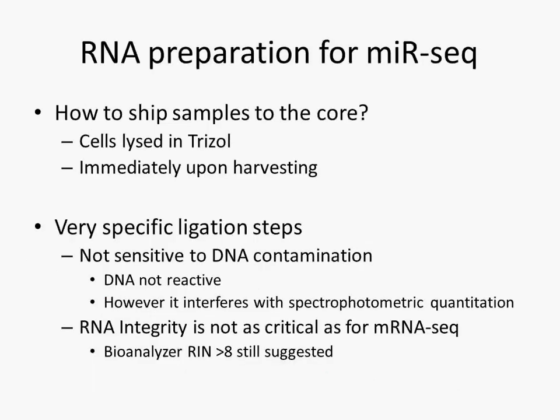So how do you prepare RNA for mir sequencing? The same way that you prepare your cells for sending to the core: lysing in TRIzol immediately upon harvesting is what we recommend. And we will take care of isolating the RNA in a way that preserves the very small fraction of the RNAs for compatibility with your sequencing.